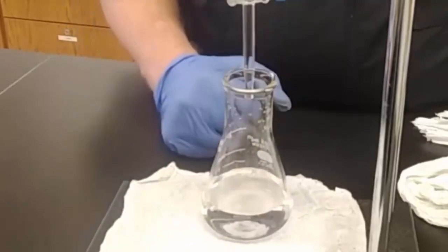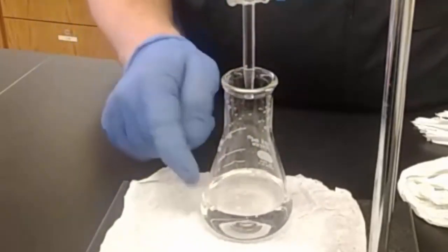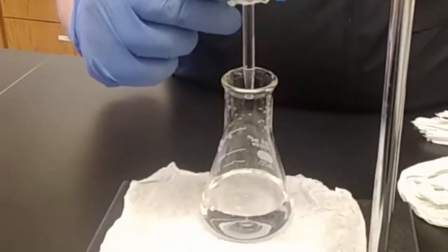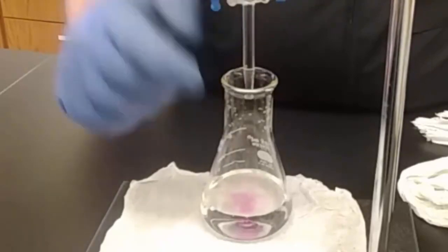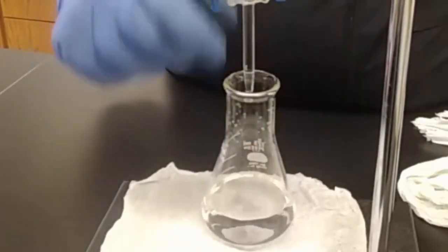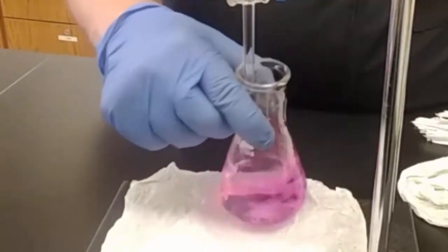If you take a drinking straw, one that you know is clean, and you shouldn't have anything in your mouth in the lab, but if you get a clean drinking straw and you blow into this after it's turned pink, it will absolutely turn back colorless because of the carbon dioxide in your breath forming carbonic acid and reacting in the solution. Oop, there we go.